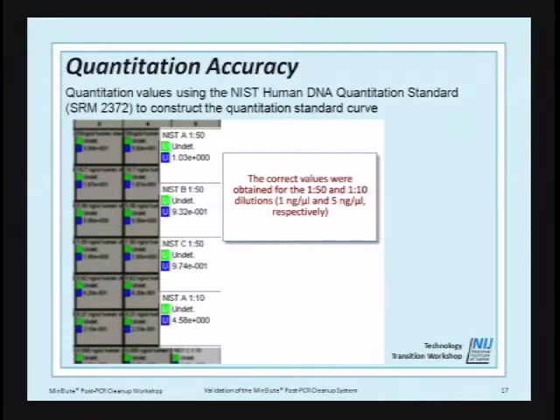So what we thought was, one week we were getting our 1 nanogram was high, and then one week our 1 nanogram was low. Where we thought the instrument was giving trouble, it was because one week our quant results, depending on the lot numbers of the quant kits, were varying so much from one kit to the next, even within the same kit. After we've used the same standard for a long period of time, not within its expiration time, we were seeing these fluctuations in the quantitation.